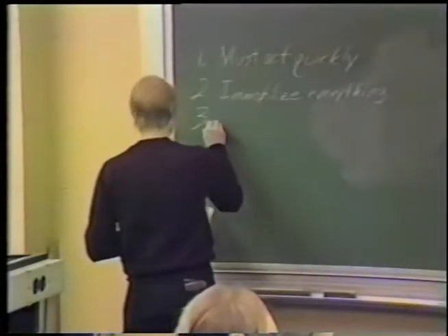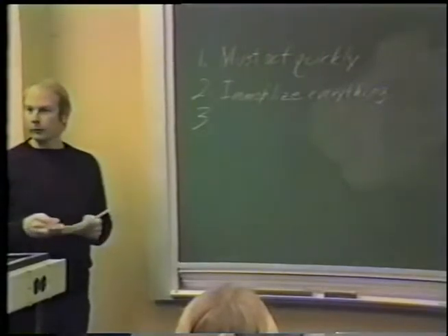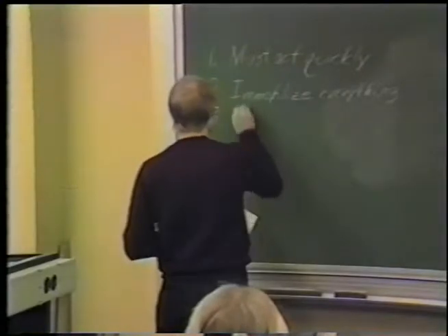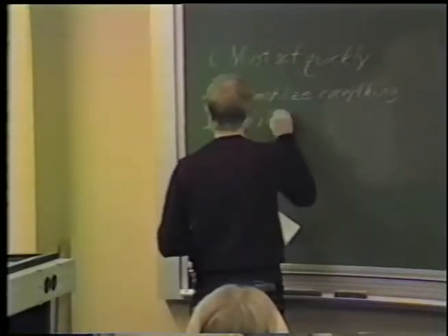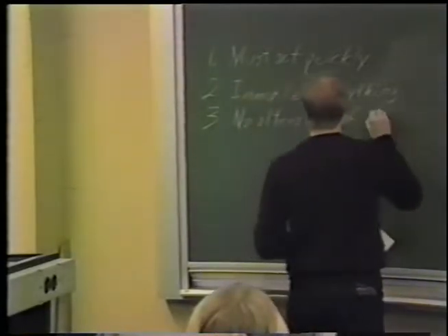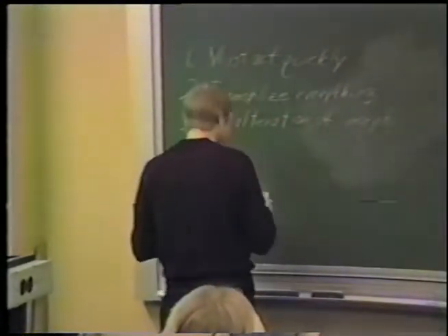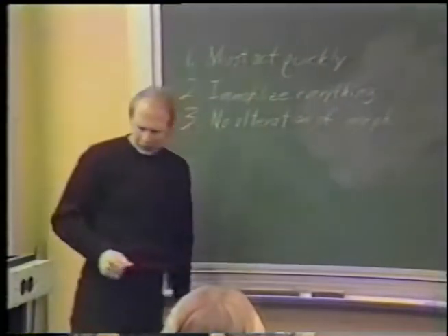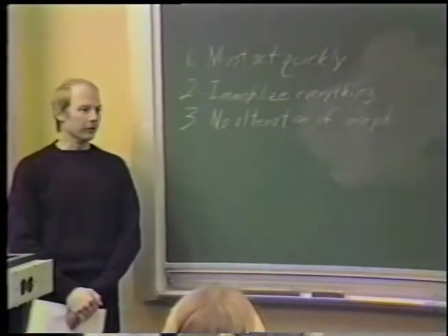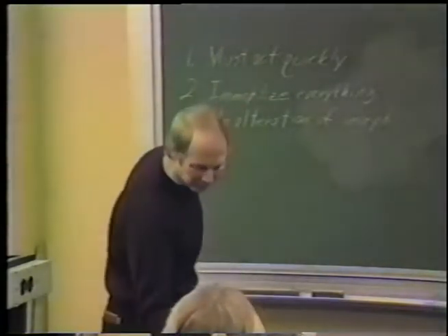Third criterion is that the fixative should not alter the morphology of whatever you're trying to look at. Otherwise, you haven't gained anything. Okay? And we should point out here that simply because the structure looks like it's well preserved, it doesn't mean that it's representative of the natural state. It might not have been there in the sample before fixation.